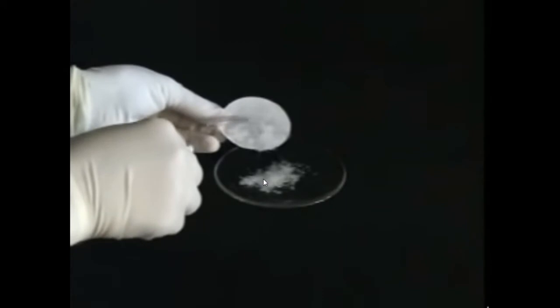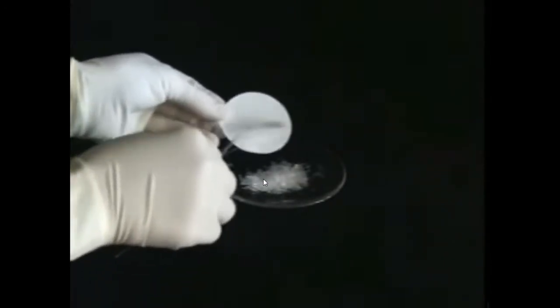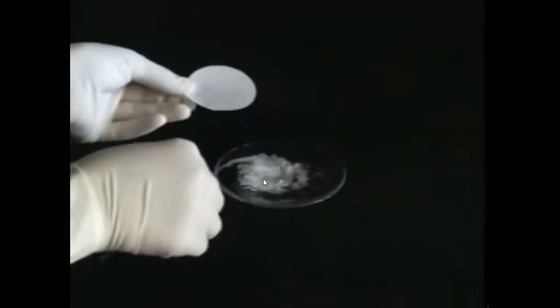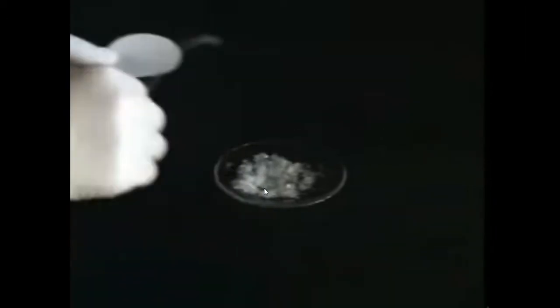After pulling air through the crystals for a few minutes, scrape the crystals onto a weighing dish and spread them out to facilitate drying. Depending on the compound, the crystals can be dried in a desiccator, an oven, or on a vacuum line.